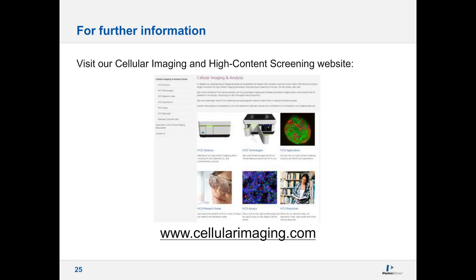Thank you. Our next question is two parts. Now, you talked about HCS assays using 3D models. What are the biggest challenges in imaging and quantifying 3D cell models, and do you have any advice to overcome them?